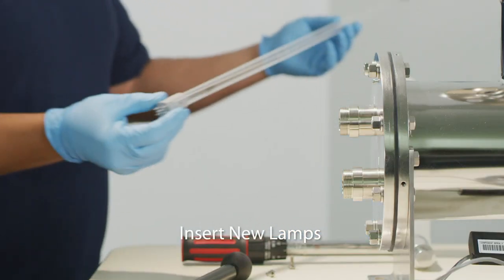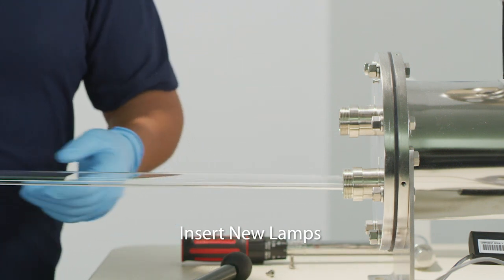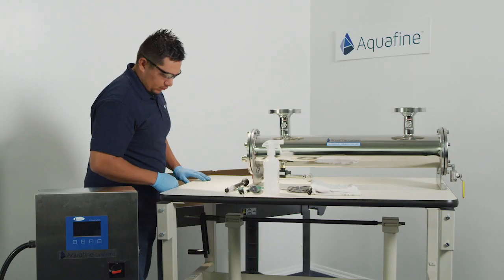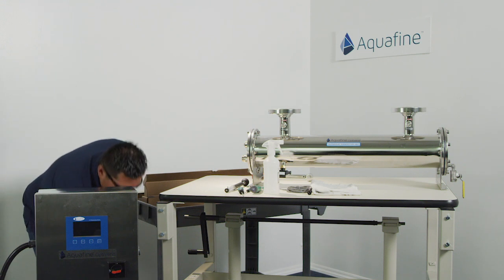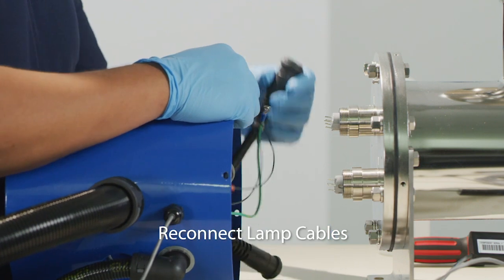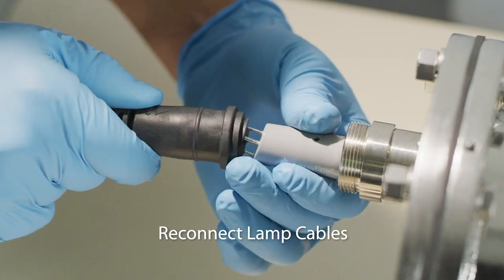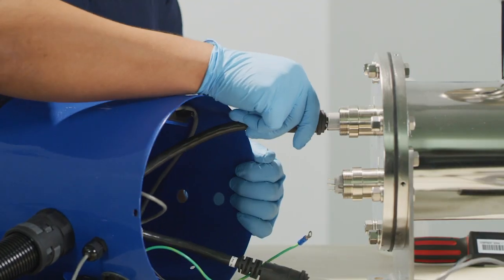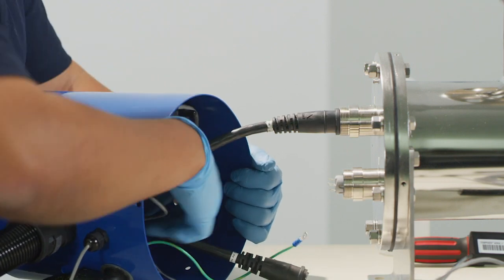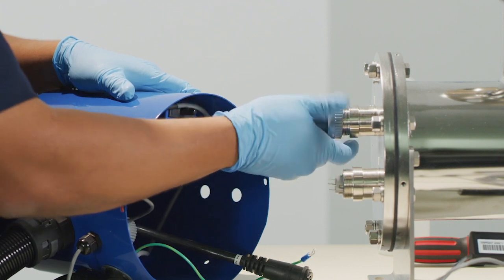Insert the new lamps into the sleeves and leave the lamp pins and ceramic exposed outside of the sleeve bolts. Bring the end cap back to the end of the chamber. Each lamp cable will be labeled with a number that matches a lamp number on the end plate. Carefully reconnect the appropriate lamp cables to each lamp and seat the lamp cable flush with the end of the sleeve bolt, pushing the lamp into the chamber. Secure the lamp cables into place using the gray plastic compression nut caps. Tighten by hand only.